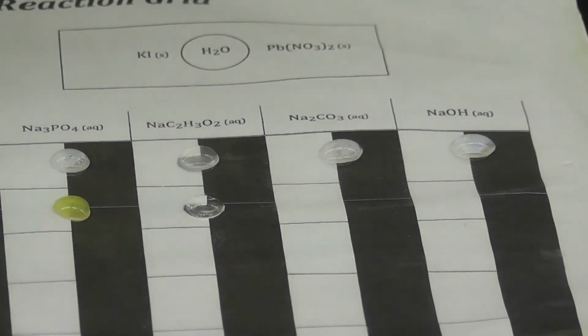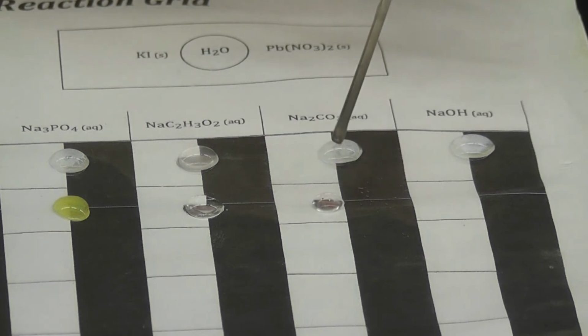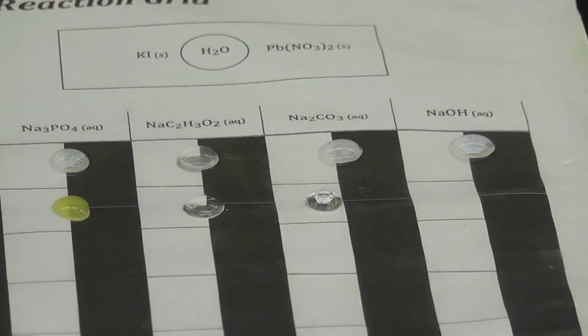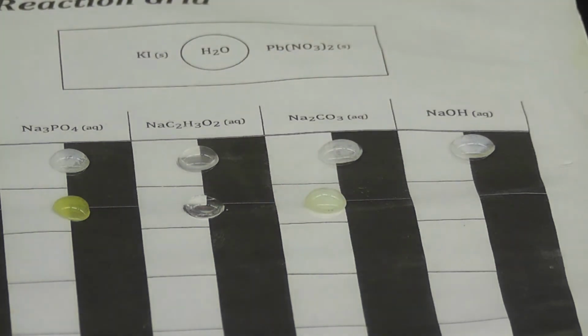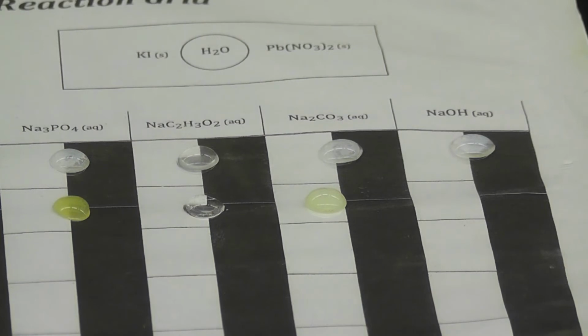Okay, another drop of silver nitrate. We have 2 more to go. Oh, let's mix that over here. Try and see it. So we're going to mix that with the sodium carbonate. 1 drop of the sodium carbonate with the, you observe a color change there. All right, and last one with the silver nitrate.